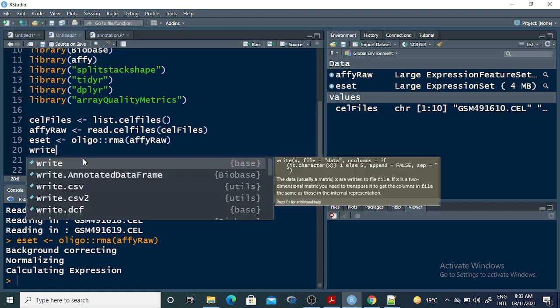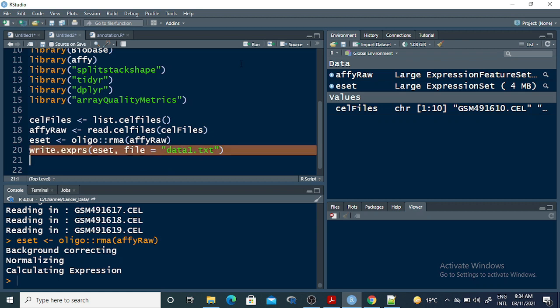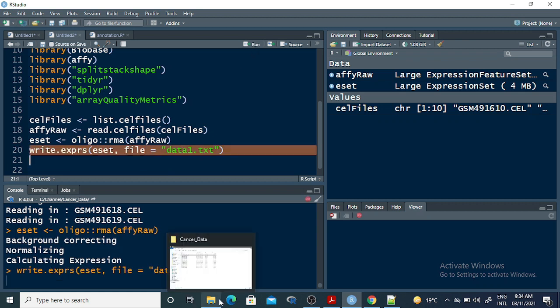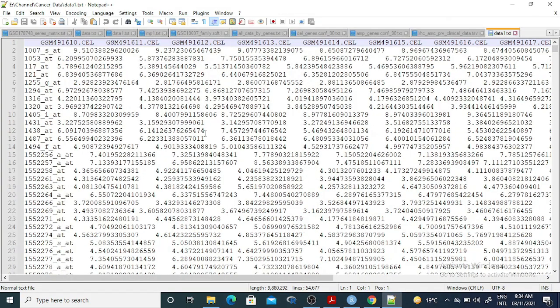Now I want to write this expression dataset into one file. I use write.exprs(normalization_rma) to save all the expression values into a file called data1.txt. If you run this command, the file is saved. Opening it, you can see the 10 samples as columns, the probe IDs, and the expression values for each probe ID — but gene information is not yet included.